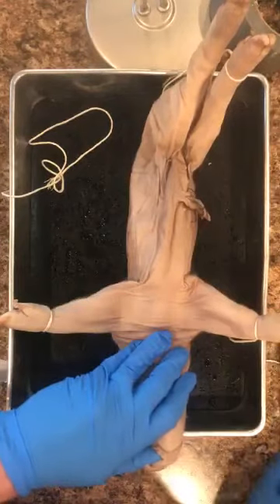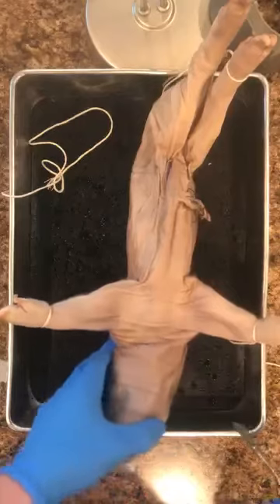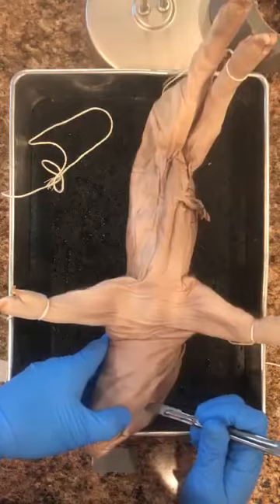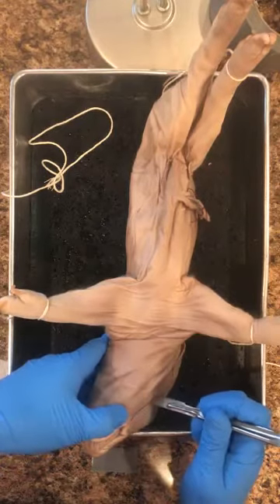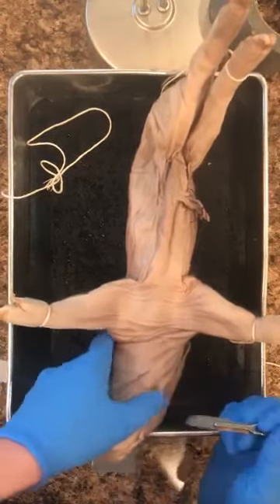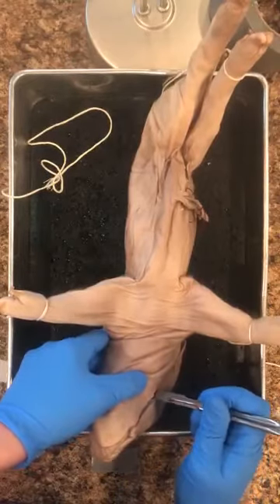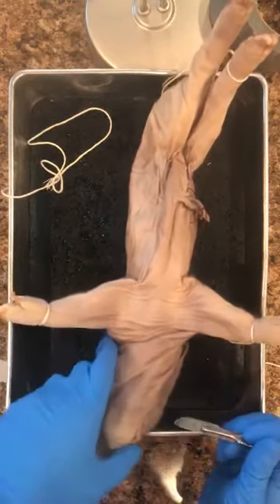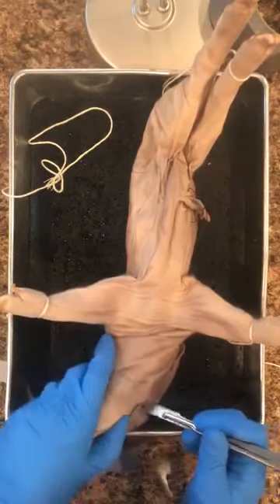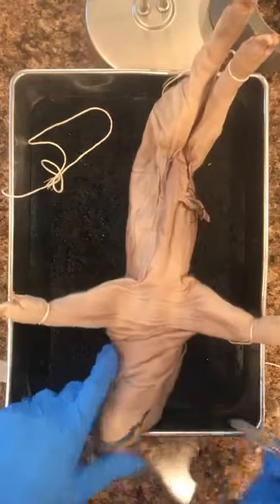I am going to make some cuts with the scalpel from the corner of the mouth back to the jawbone. I'm definitely cutting through bone at this point. Okay, that's one side.